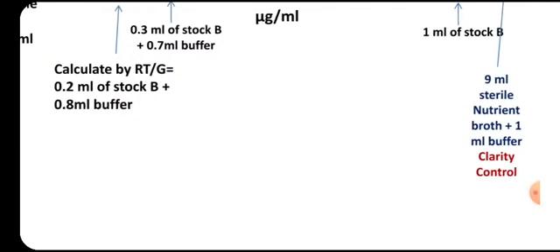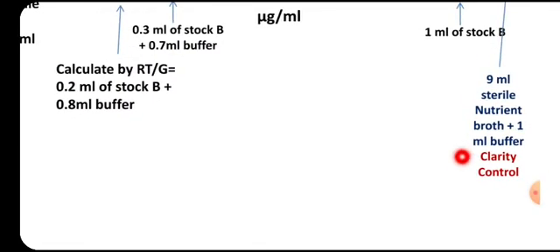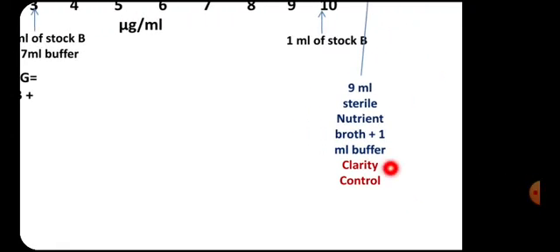This will be called as clarity control. So only nutrient broth is there. Along with that, there is presence of buffer. Sterility control or clarity control.